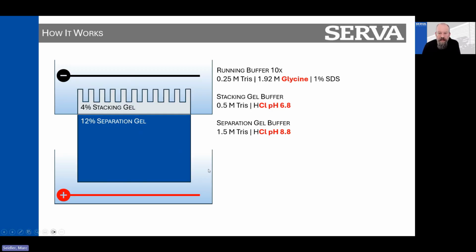Around the gel would be a classical zone electrophoresis, like an agarose gel for DNA, a submerged chamber or, yeah, a horizontal DNA chamber. But no, we want a complete cut off of both buffer tanks, and they are only connected through the gel matrix.